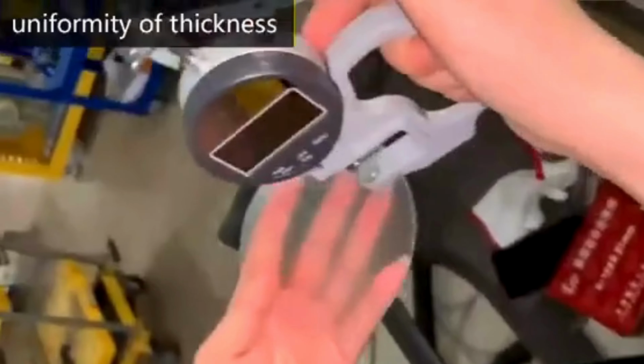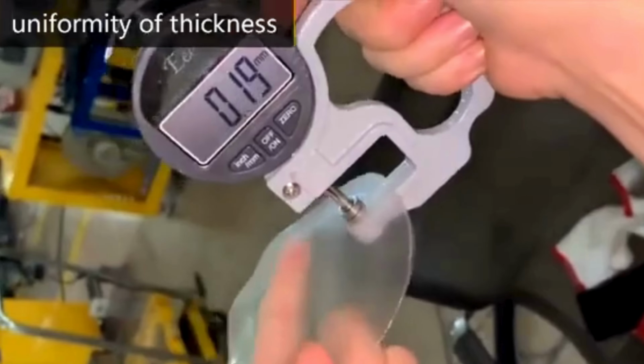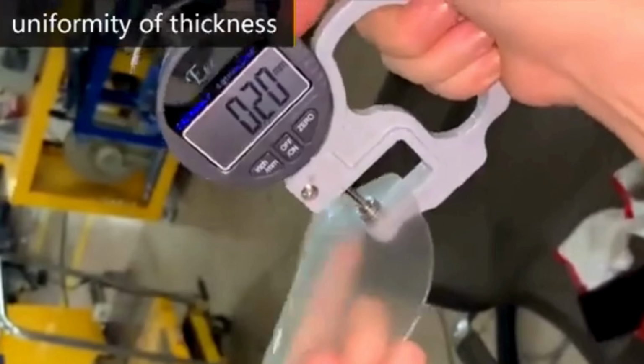particularly from thermoplastic materials and certain thermosetting systems. It is closely related to hot pressing, but typically emphasizes mold-based shaping under controlled pressure and temperature to achieve uniform thickness and high structural integrity.